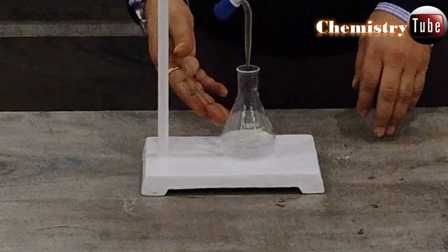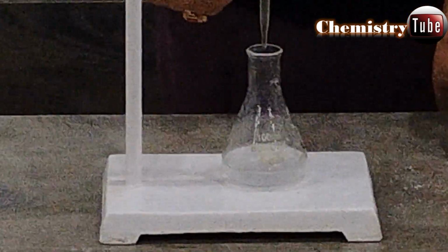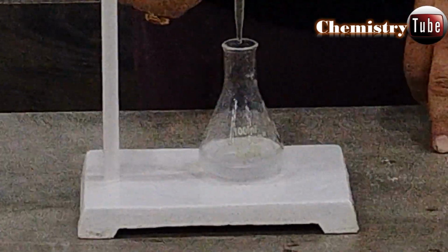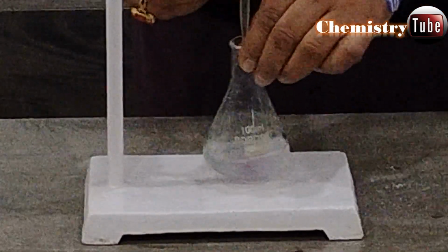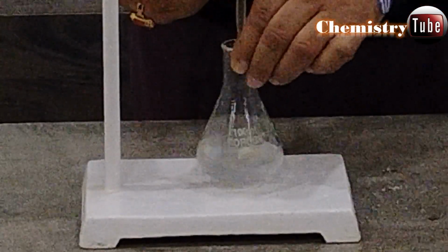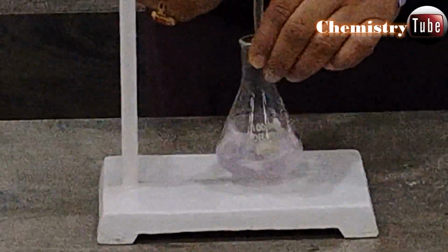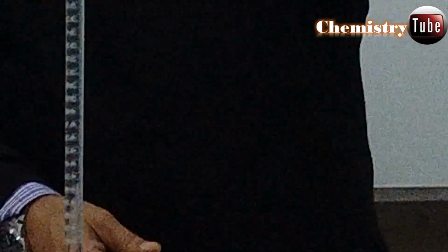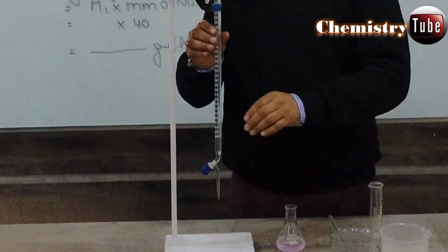Now if you can please zoom in for me. We are here. Okay. Keep patience. Keep running this NaOH solution into the oxalic acid. You will observe that this pink color is getting settled. Okay. Still we haven't got our endpoint. We need a few more drops of NaOH. Okay. Now pink color is appearing. Okay. Now you can see that we have got a very light pink. We have reached our endpoint, and now we can record our first reading.